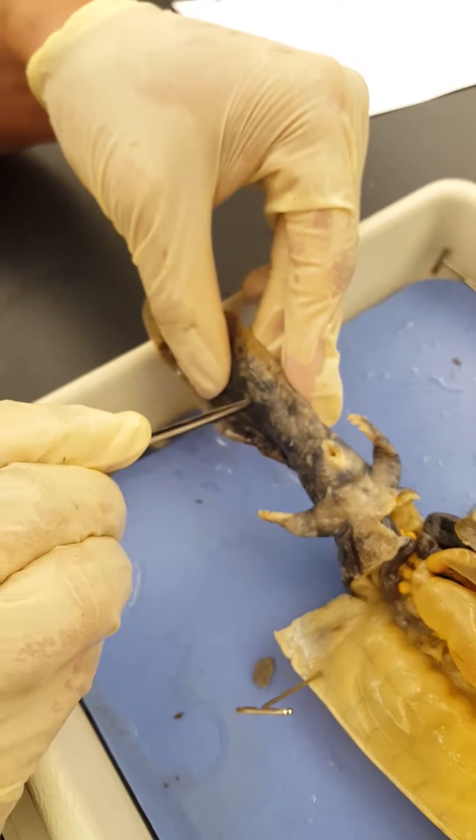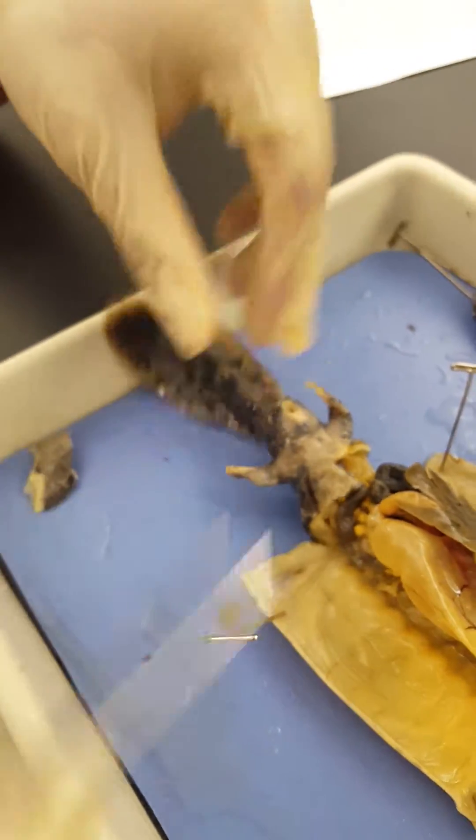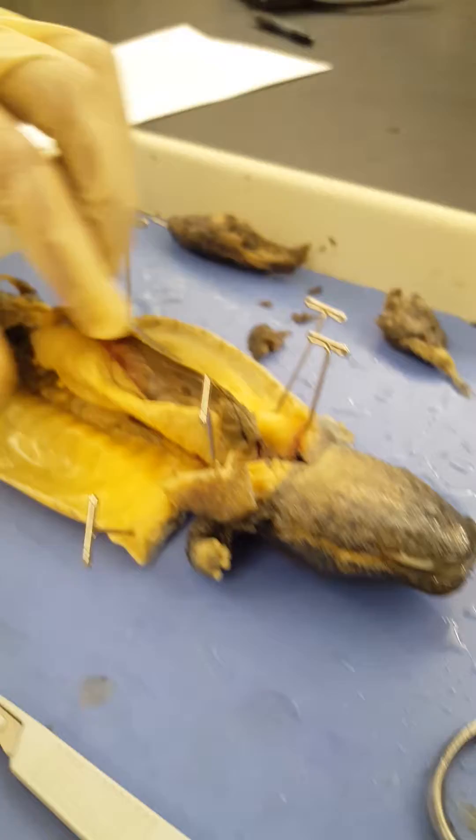This is the lateral tail — a laterally compressed tail. These eyes on the salamander are very small. It has four fingers. And that's it.